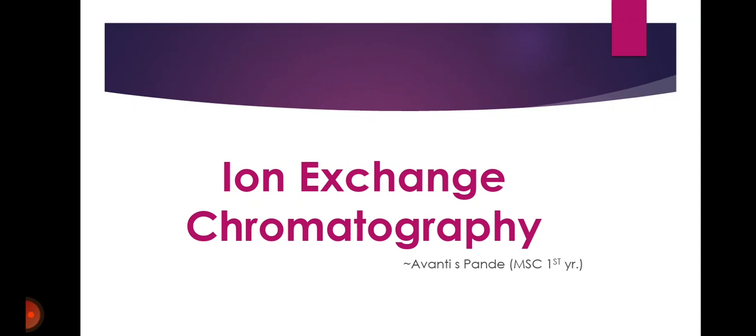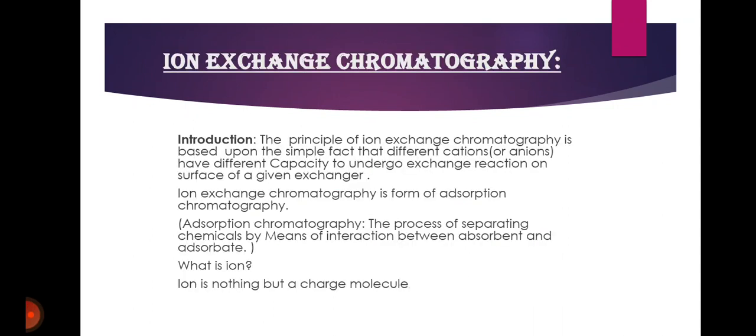Now let's just start with an introductory portion. The principle of ion exchange chromatography is based upon the simple fact that different cations or anions have different capacity to undergo exchange reaction on the surface of a given exchanger. Ion exchange chromatography is a form of adsorption chromatography.